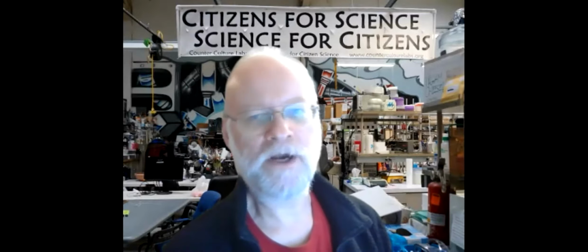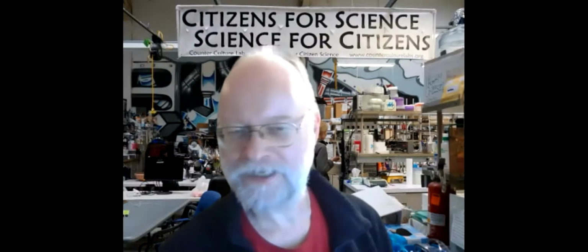And this is what happens with our agar art as well. You have a window of maybe a few days where the picture is at its optimal. And after that, all the lines are getting fatter and the colors are starting to fade. I'm just wondering too, on the opposite end from nanoparticle vibrations, if you go all the way to DIY, how might something like this translate into a micro:bit, simple, maybe 2-color, you've got a servo motor and you're just coding in block code on the micro:bit, and you're dropping, maybe kombucha that's been colored with cactus fruit or carrot.